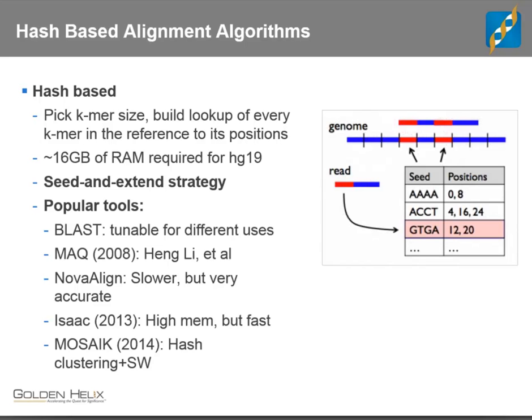And I think it was a watershed not only because it established a lot of the logistics of what an alignment algorithm for next generation sequencing does. It read FASTQ files, it created the idea of Phred score mapping qualities and all this kind of stuff. It also set the pace and was something that people have been benchmarking against and iterating on since.